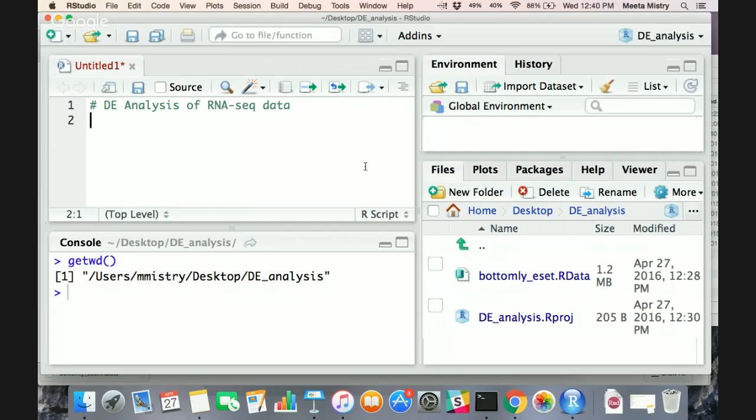So did you start a new article? I would go ahead, it's going to be up at the top. Okay, so what happened is RStudio recently had its new project, and it also moved that folder. So basically, you now have this folder on your desktop. That's where it sets all the files you can reference, and that's where it's going to put the files. So all you need to do now is find that downloaded file and move it in there.